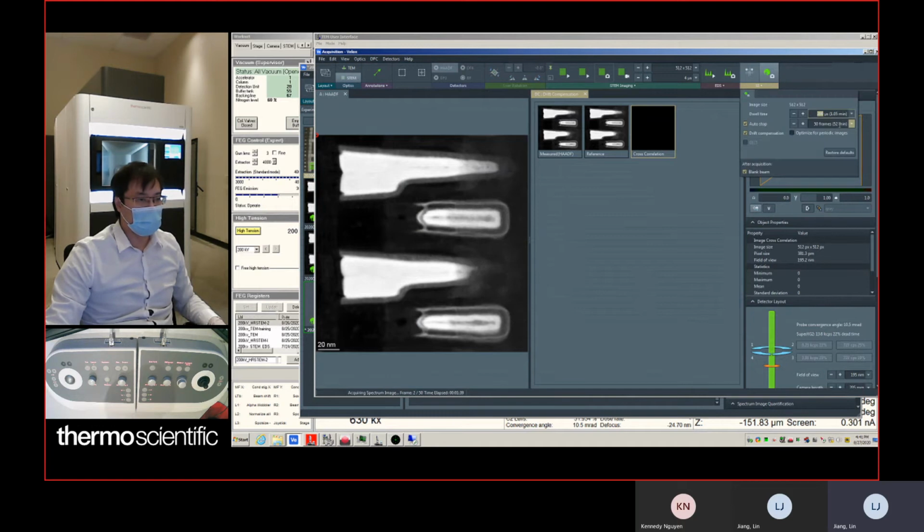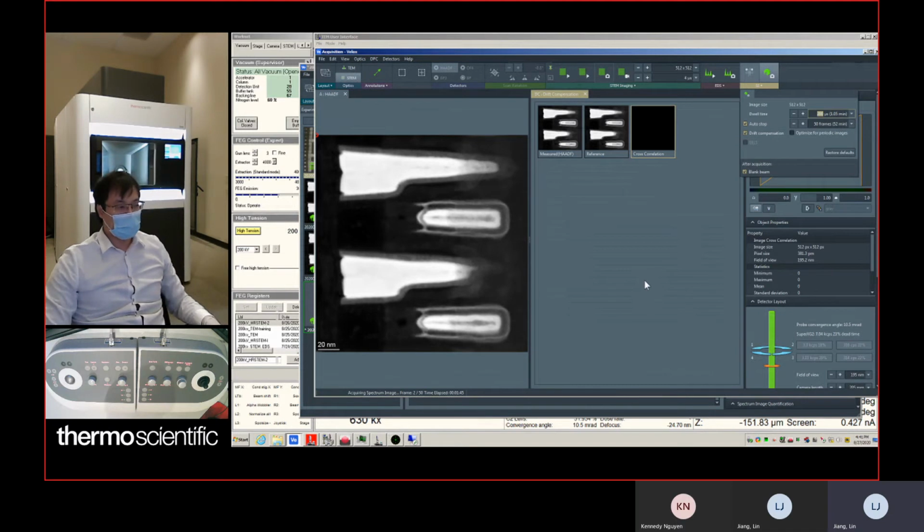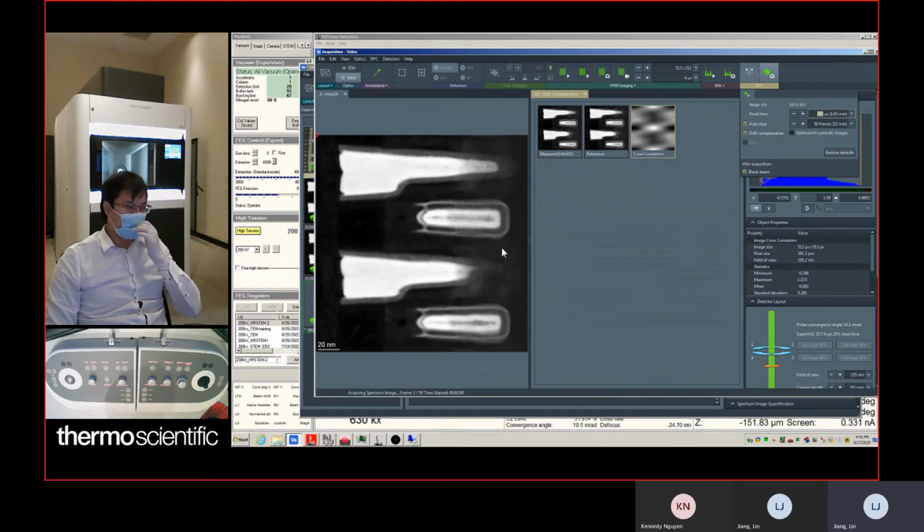It's going to take a minute to finish one frame. So if you do a 5 or 6 minute scan, we only have 5 to 6 frames, right? If the stage moves a little bit, it's going to take up to a minute to bring it back, because every minute it does a drift correction.